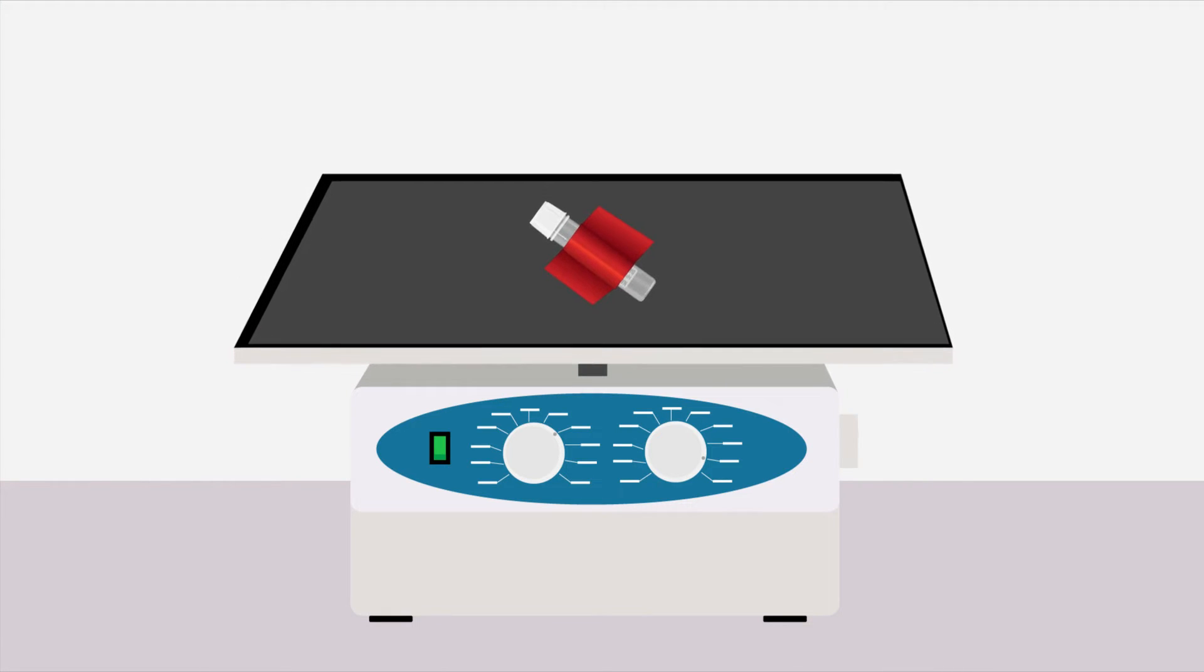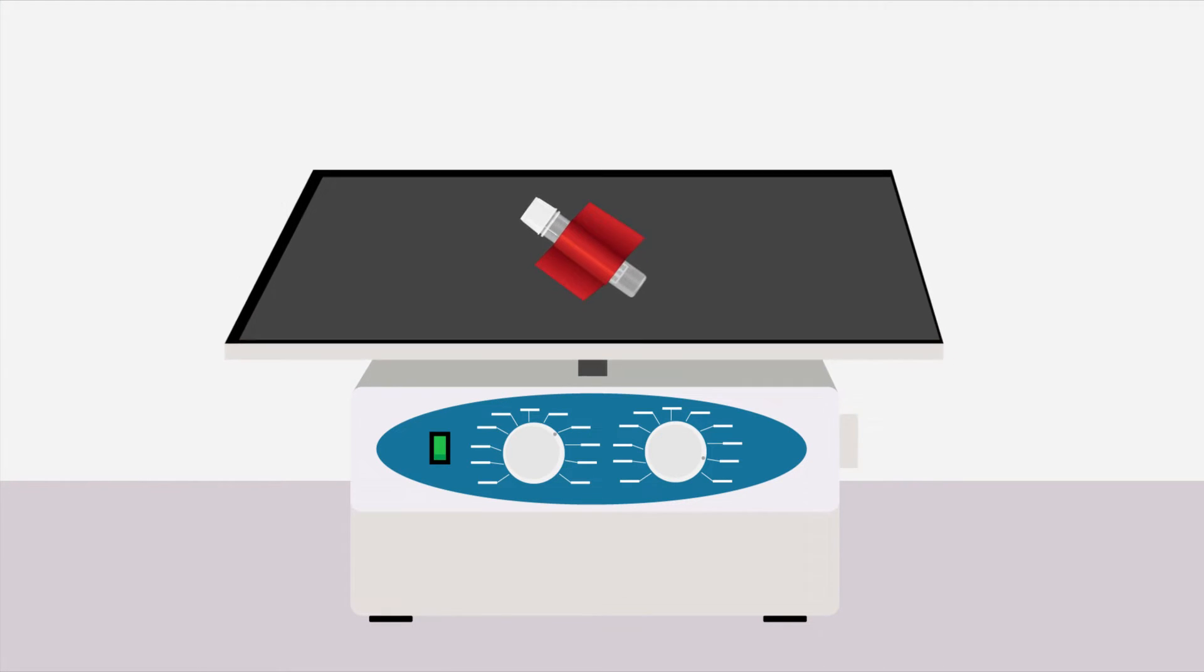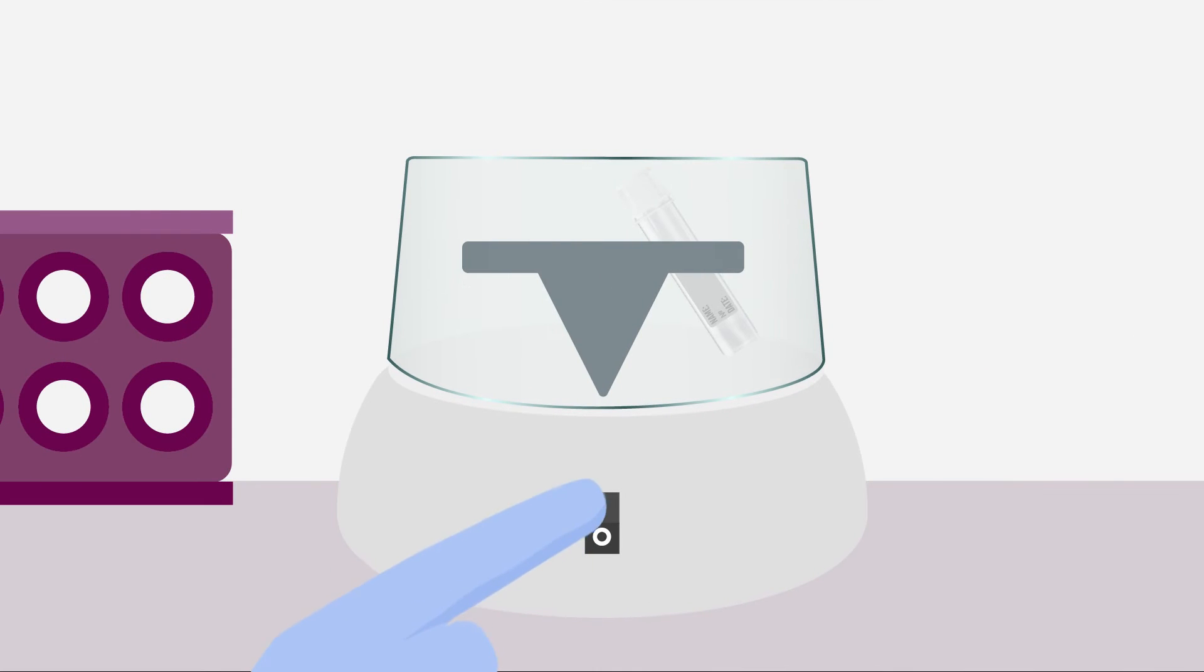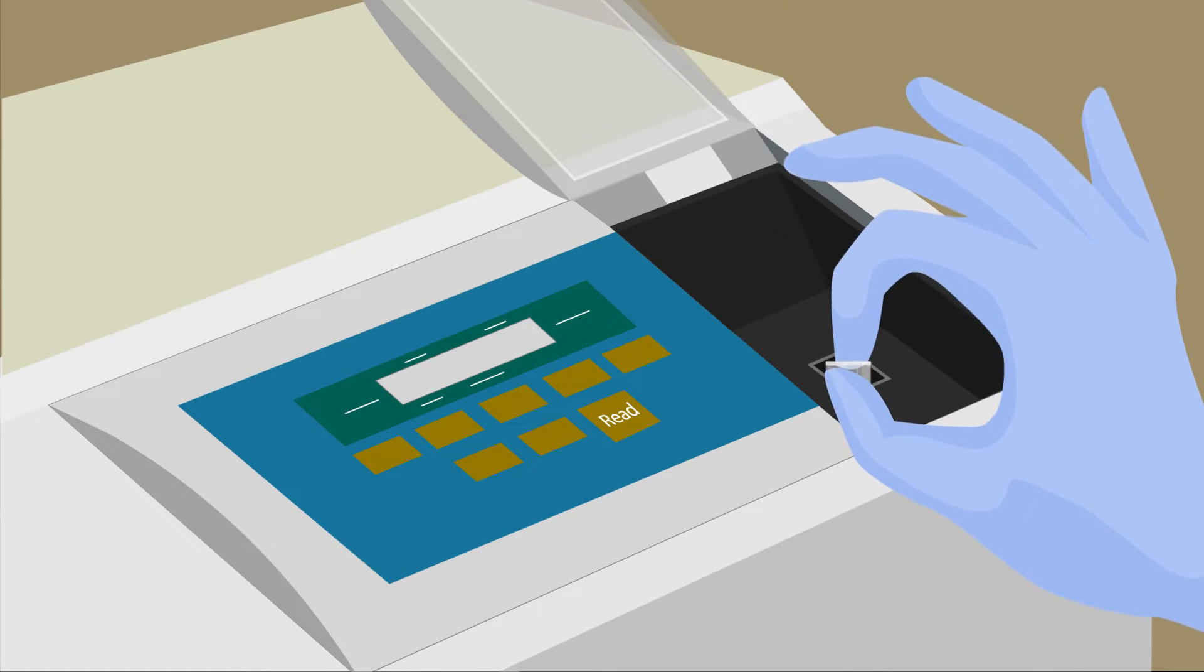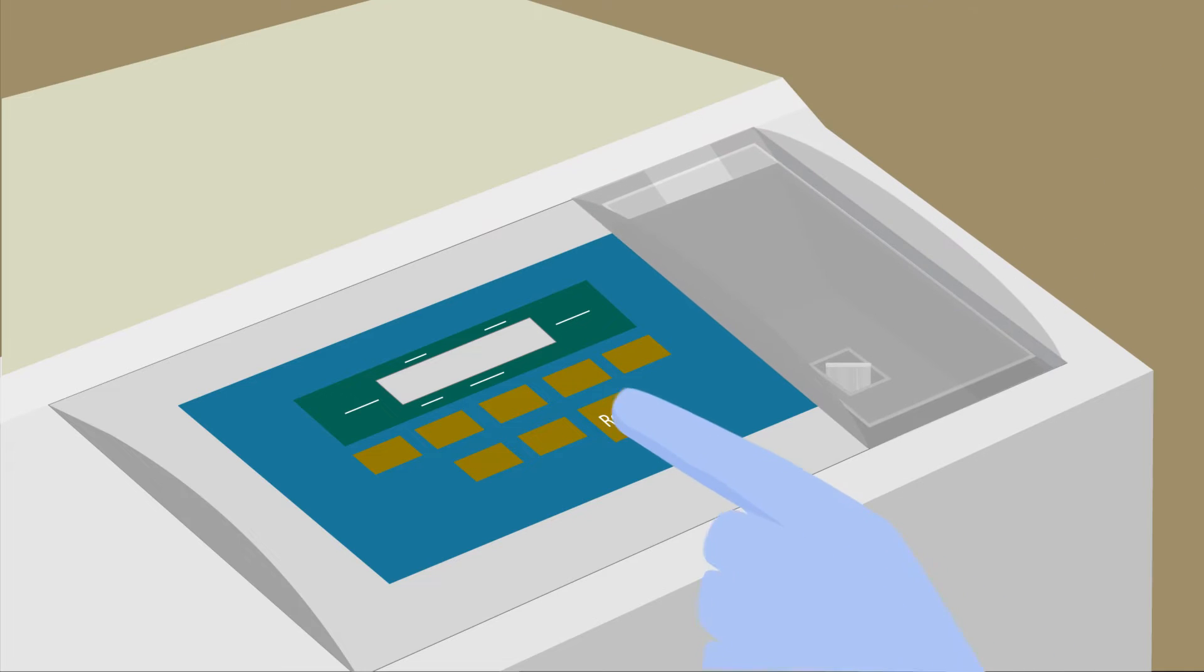Briefly pulse spin the tube to make sure all of the siRNA is at the bottom. Next, verify the siRNA concentration by measuring the UV absorbance at 260 nanometers with either a nanospectrophotometer or, as shown here, a traditional spectrophotometer. When using a traditional spectrophotometer, use Beer's law to calculate the siRNA concentration.